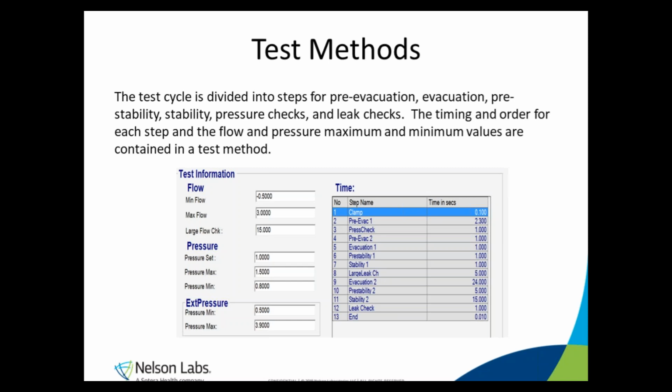For an inline manufacturing mass extraction test setup, where you have fixtures that are specifically built for a single sample type, you can optimize these methods to run in just a few seconds. But we opted for a longer test method so we can use the same method for a wider variety of test samples.